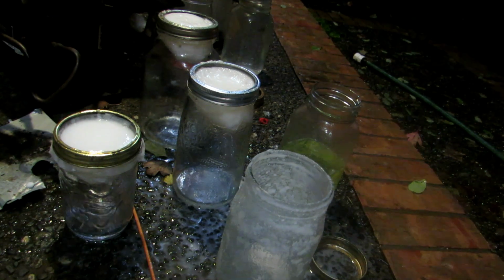Of course, after this is done filtering, we can simply check to see if we actually have any sodium silicate back in solution by just adding a bit more hydrochloric acid. So I'll let this filter and meet you back.